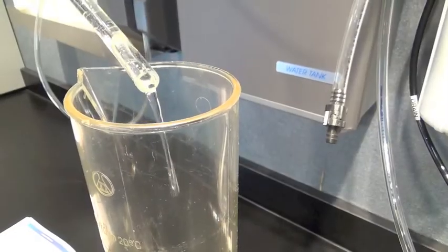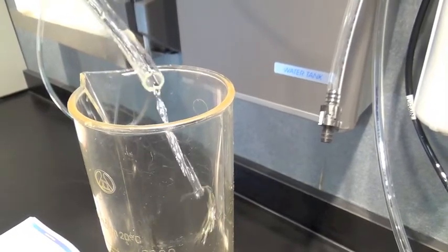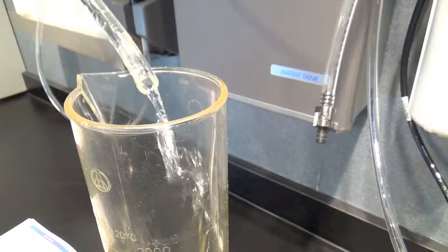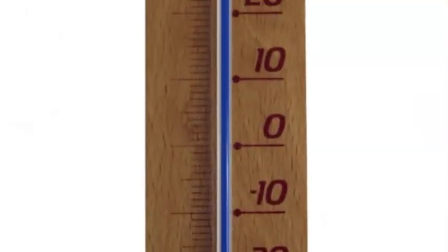The WaterPro RO system dispenses RO water through the dispense valve at a rate of up to one liter per minute. The dispense rate depends on the temperature of the tap water, which optimally should be 25 degrees centigrade.